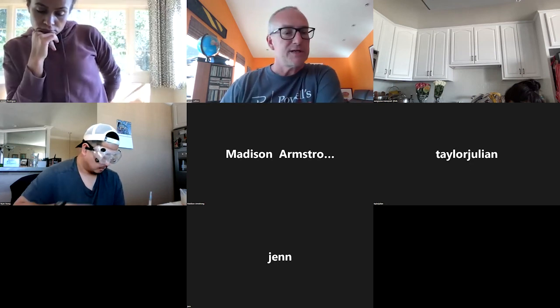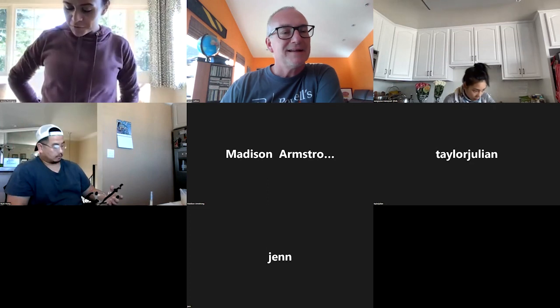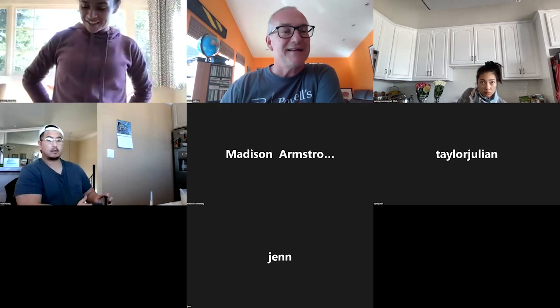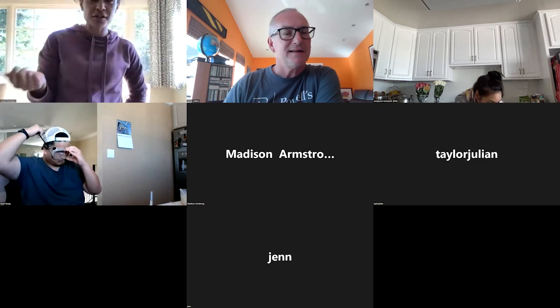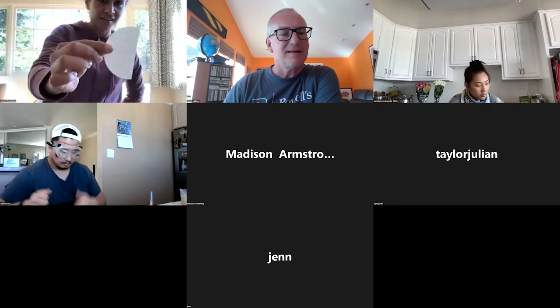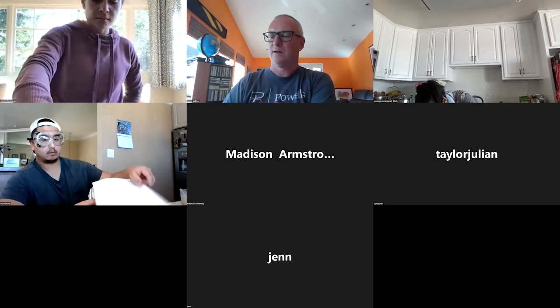All right, any other questions? How you doing, Jessica? How's it going? It's going well. I just started the temperature one because I had to cut all the squares. Oh, you had to cut them out. Yeah, that took forever. I can imagine. So how did you manage to keep them a uniform size? I measured first and then I just cut it. Yeah, there you go. So how big are yours? 6 by 6 millimeters. Okay, so yours should take a little bit longer then.